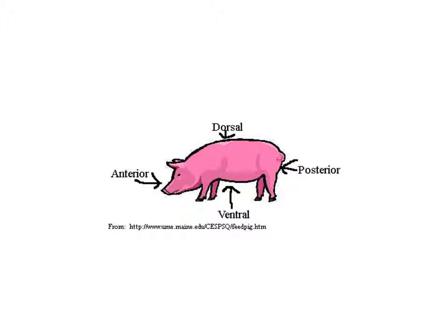Sometimes you have to think hard about which side is which if you think about yourself, because we don't walk on all fours. Our dorsal side is now our backside, so that's not quite right. Remember, the dorsal side is part of the spine. Think of the dorsal fin, which is famous on a shark or a dolphin. Okay, that's dorsal. Posterior. All the other ones are good too.